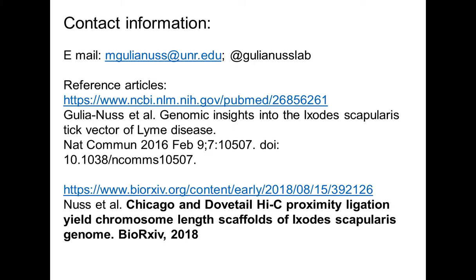Thank you. Thank you both. Next one is, what if my scaffold N50 is less than the recommended minimum of 20 kb?